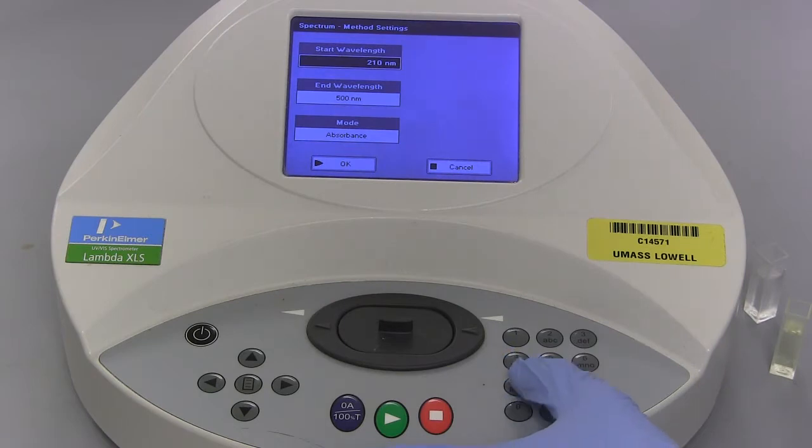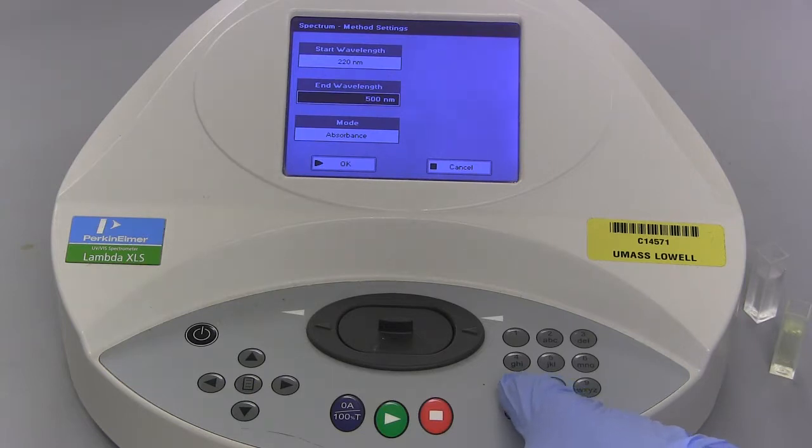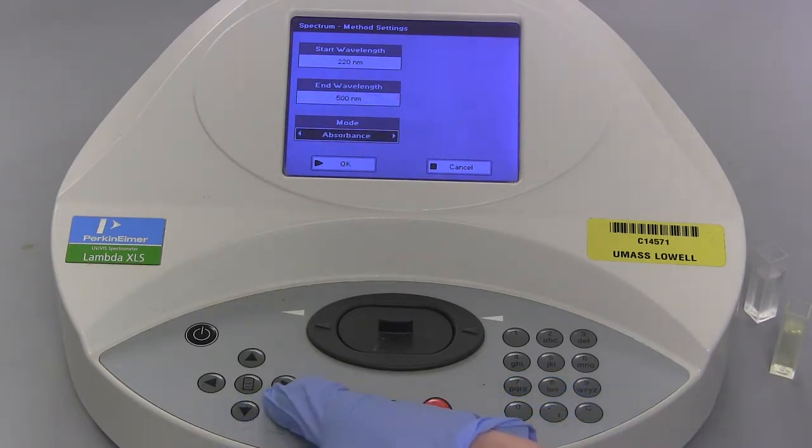Select the start wavelength and with the keypad input 220 nanometers. Press the down arrow key to select the end wavelength and set it to 500 nanometers. Select the mode with the down arrow key and with the left or right arrow keys select absorbance.